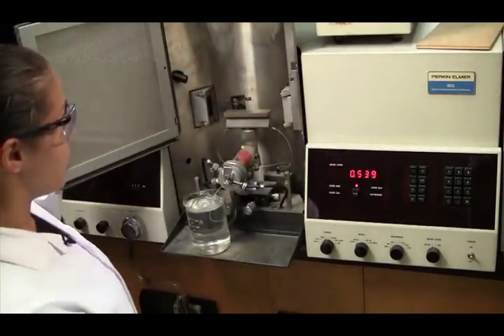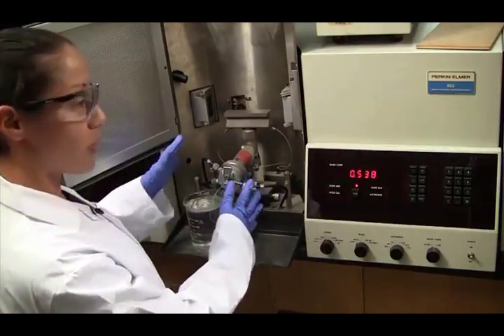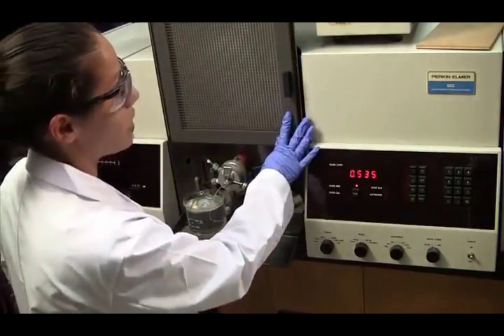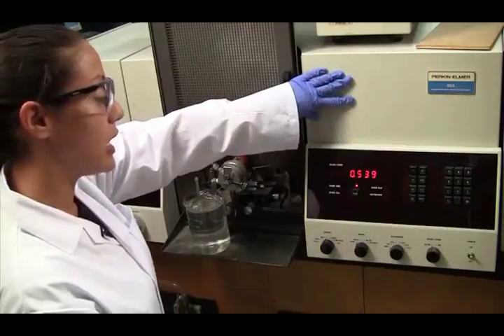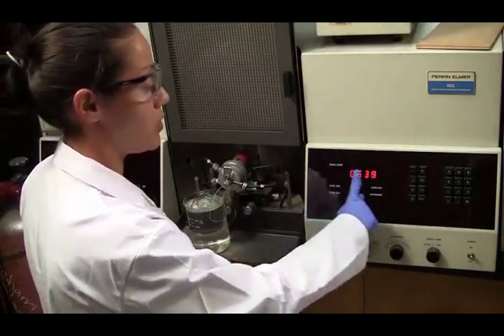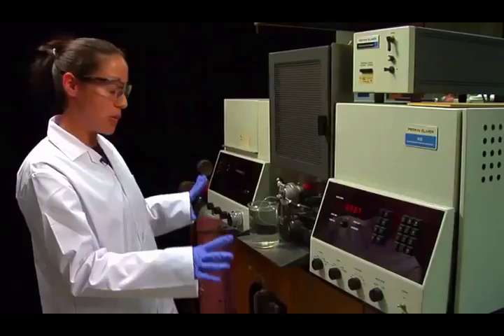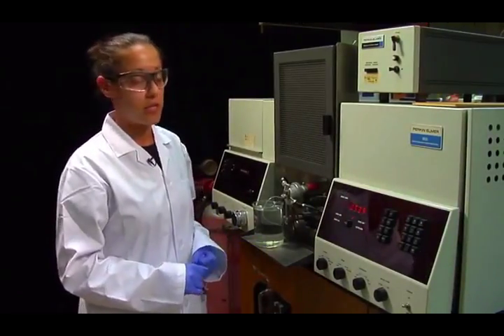Inside here, you have your burner. And this is where your premixer and aspirator are, where your sample is going to be sucked up to go into the flame. And in this part of the instrument, you have your monochromator, your detector, and your amplifier, just to give you a signal. So all those components allow you to give an absorbance reading here. So those are pretty much the main components. There's a lot of knobs and stuff, but again, you don't have to worry about that for sampling.